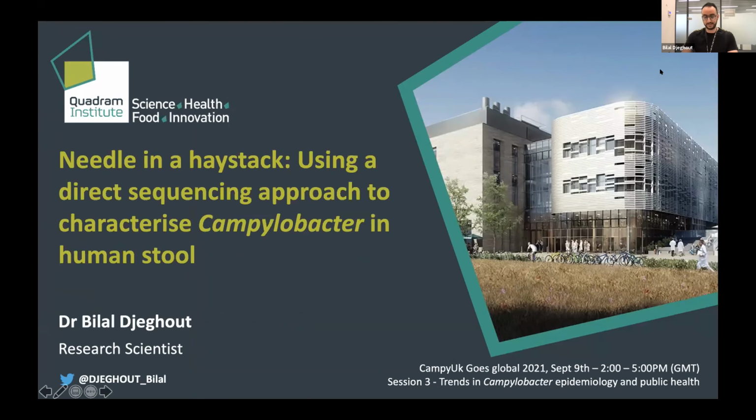Hi, hello, everyone. My name is Bilal. Thank you for having me here. I'm a postdoc at the Quadram Institute Bioscience in the UK. And today I'll be showing you how I employed a direct sequencing strategy to characterize Campylobacter genomes from metagenomes using human stool.